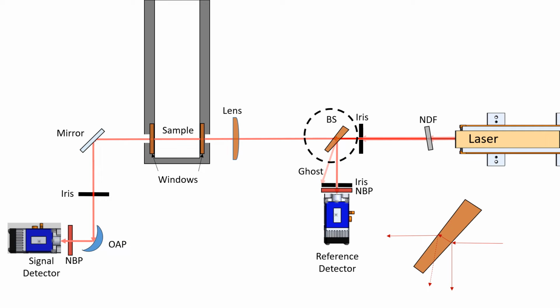I've depicted a plate beam splitter, but there are several other types available. Thorlabs has a beam splitter selection guide as a tab on all their beam splitter product pages. The plate beam splitter passes some percentage of the light approximately straight through, again with a slight offset on the transmitted beam due to refraction, and turns the remainder 90 degrees.